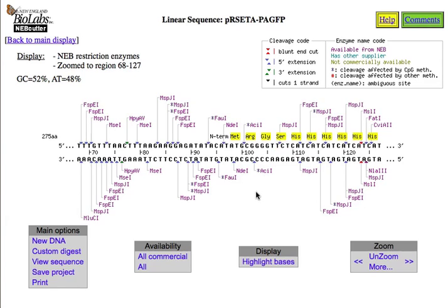When I look at some of these restriction enzymes that are over here, like NDE1, it cuts with one site, but it cuts right here. So I would be outside of the GFP protein, so that's not going to work. ACI1, that one also, well, it may work. It may not disrupt the start codon because it cuts after the G there. But notice that it cuts 45 times. That's no good.